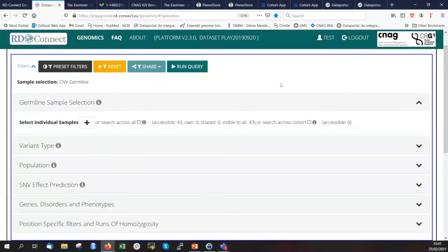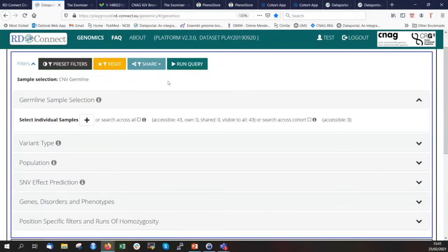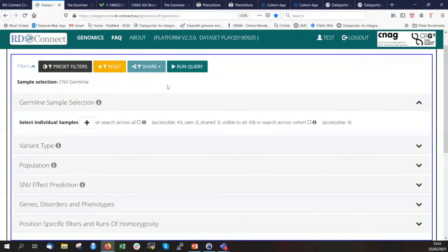Okay, so Leslie, maybe go ahead and do one case. Okay. So yes, as I mentioned, we have 20 minutes, so we don't need to rush.